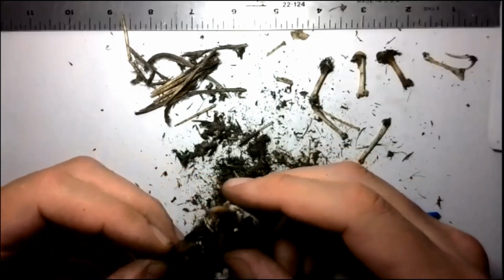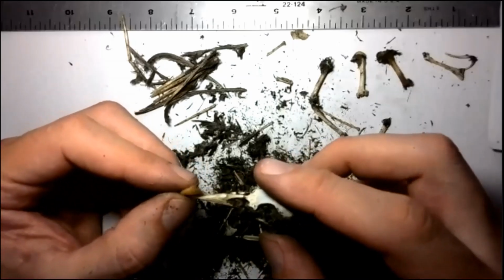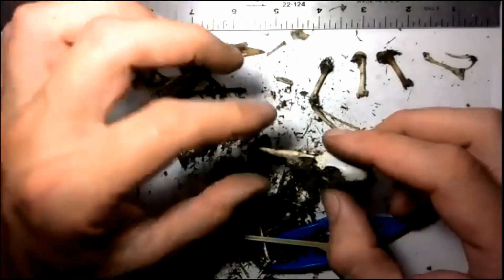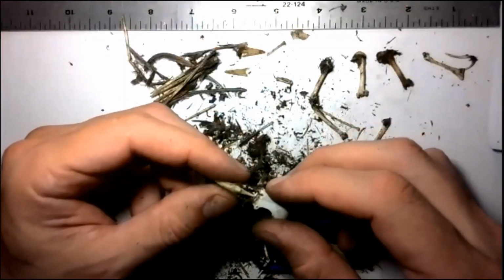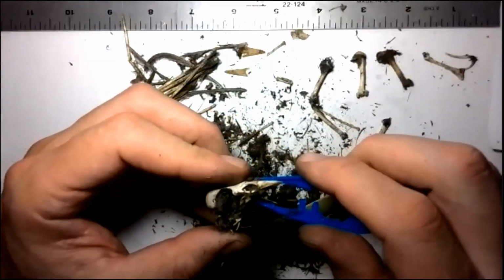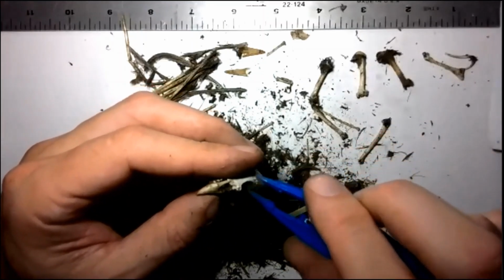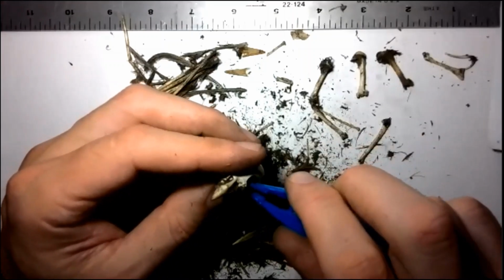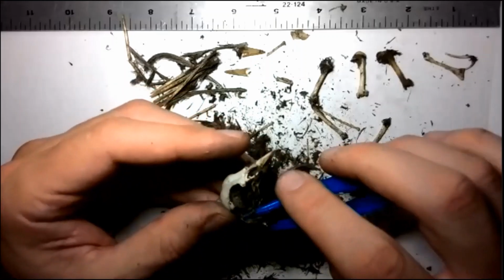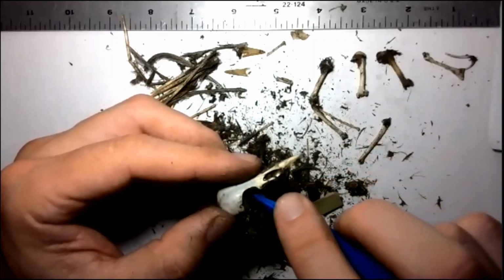You know, it's an interesting thing. On top of the bone, birds have this soft keratin. Keratin is the same material as nails. And you see the cover just fell there because I was a little sloppy removing it. It's still keeping some color, some orange color. And just by that and the shape, I would dare to tell you, I suspect this is a robin, or a relative of any kind. Now you can extrapolate because robins are so abundant and the size matches, that I would call it an educated guess, or uneducated guess, that we have a robin skull here.